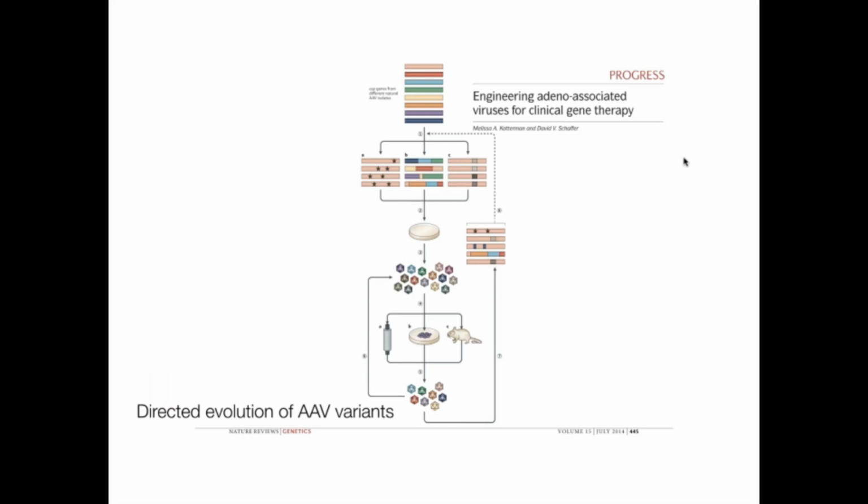So there are a couple of different ways to generate new AAV variants. The most popular is directed evolution, basically where you modify the cap gene with either error-prone PCR or DNA shuffling between different cap variants, and then you inject or transduce cells, fish out the efficient variants, the ones that could infect. Then you go back and rescreen, and you do this about half a dozen times.